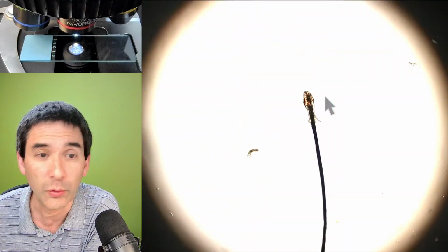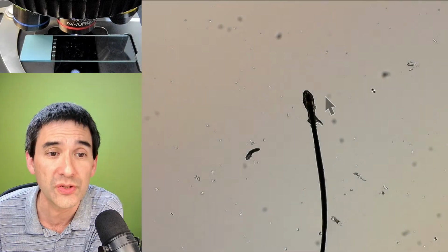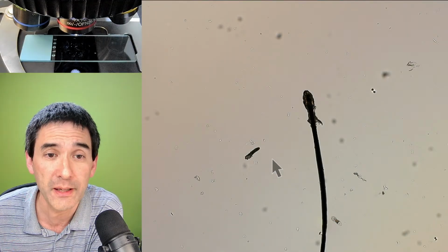Let's go down further. That is now the lowest magnification, the 4 times objective. I have to swing out the condenser here so that you see this. You see over here, that's again the eyelash. Yeah, that's the face mite.